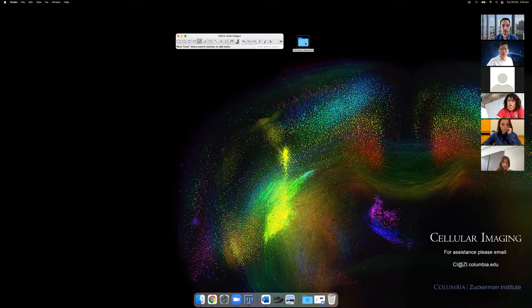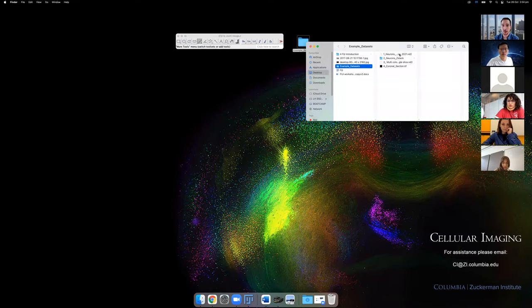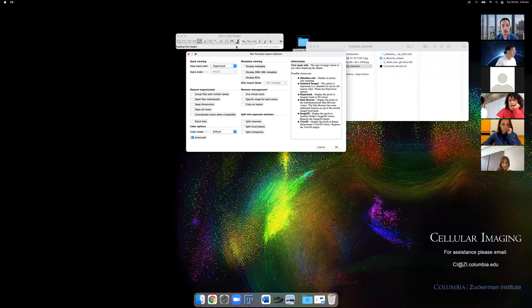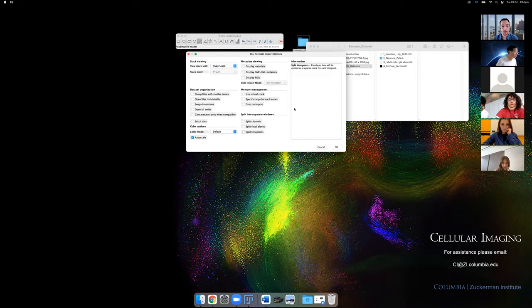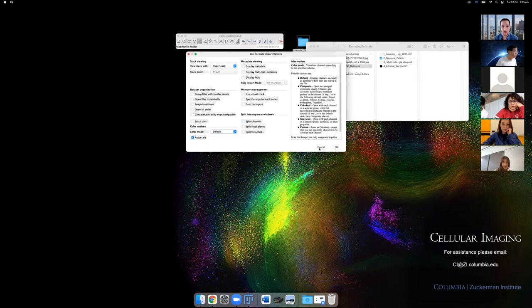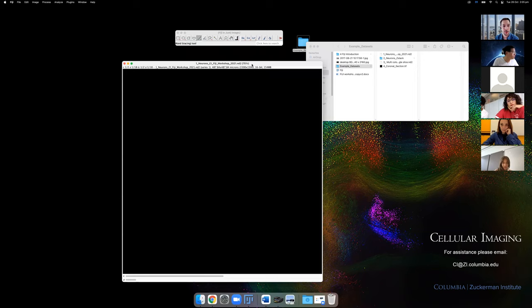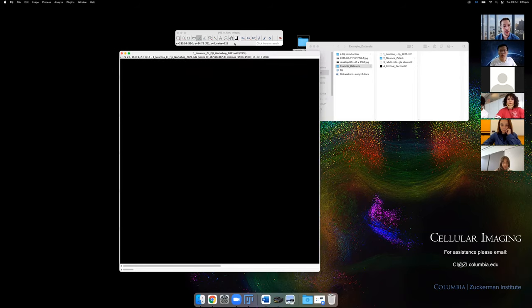I shared some example datasets — one is an ND2 file. Sometimes people are tempted to save data as TIFF files at the microscope, but it's a really good idea to keep them in the proprietary format. We use many Nikon and Zeiss systems here, so the ND2 or CZI format is best. The BioFormats importer will allow you to open many of these images straight away.